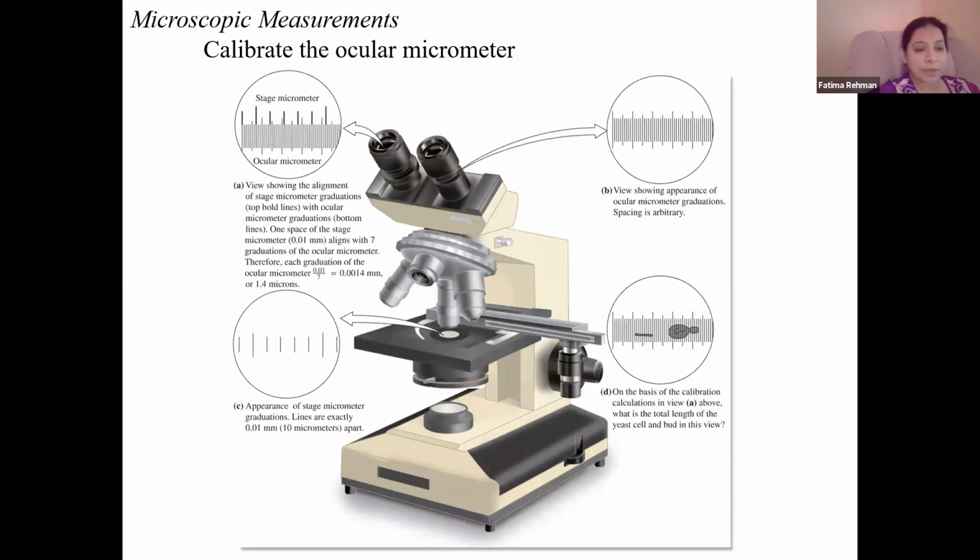There's one other way to adjust the amount of light. It's the aperture, and you can control it with the condenser and the diaphragm setting down here. There's a sliding switch underneath that adjusts the amount of light coming to your specimen. You adjust the brightness of light from the actual light source, and you can make it as dim as possible. Then you can adjust the amount of light that's actually coming to your sample by moving that switch left to right, depending on how you want it.